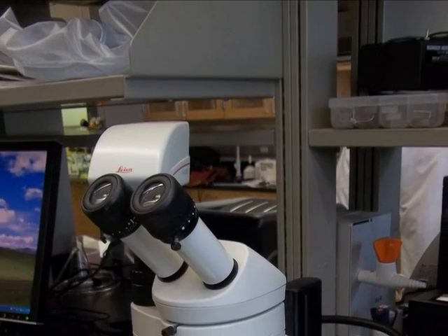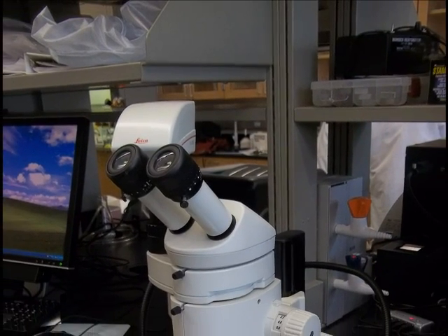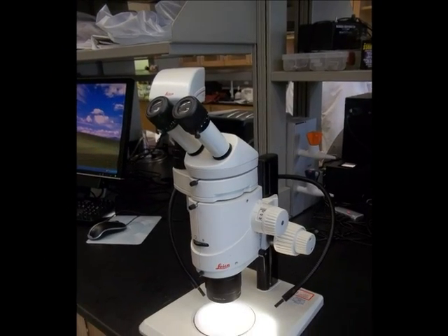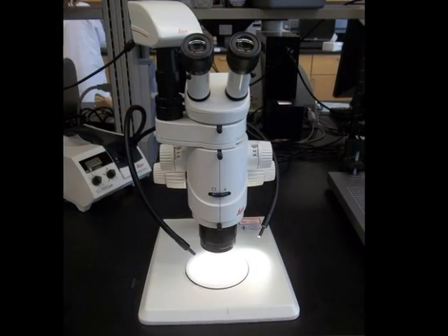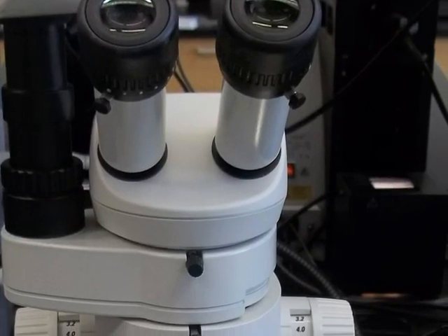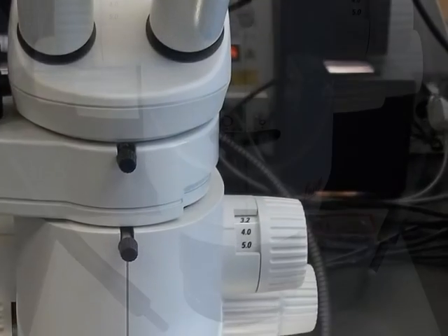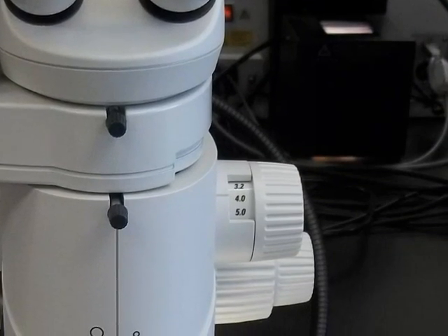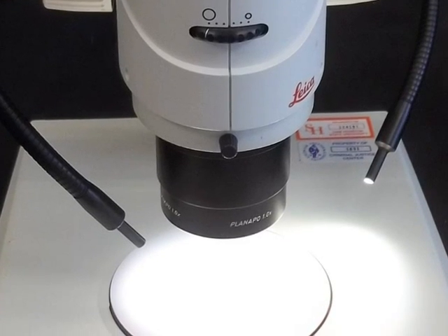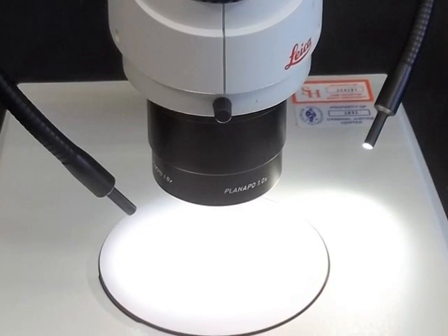The stereomicroscope is an efficient forensic examination tool that can be used to magnify and observe the surface details of a sample. It is composed of several components, which include the eyepiece, magnification changer, fine and coarse focusing knobs, and a luminaire for transmitted light. Each of these parts has an important function which makes it beneficial to use in forensic examinations.